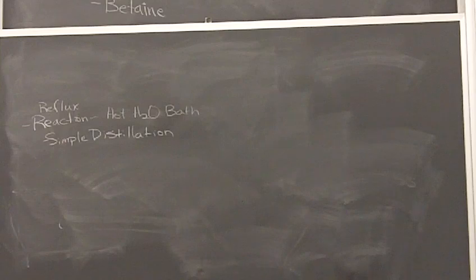The other thing that gets a little hard to figure out is your product is a liquid, and so when you're distilling, you're going to get down to where it looks like there's just residue left, part of which is actually your product, all right? So what we are then going to have you do, and this seems kind of counterintuitive, but it helps to remove the methanol. You're going to take apart your distillation.